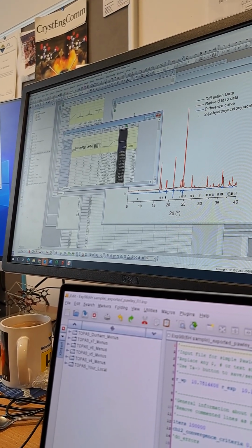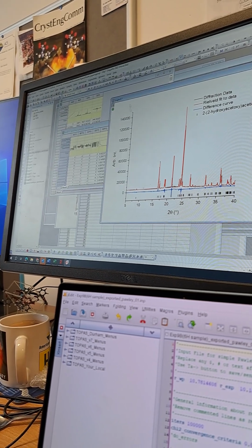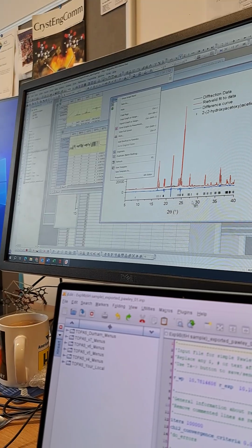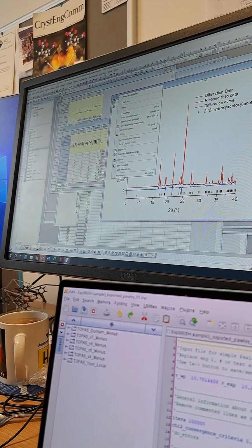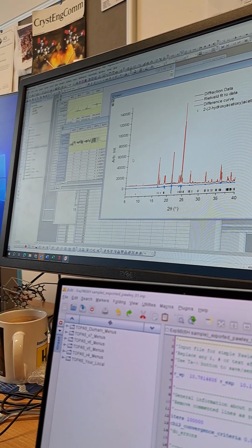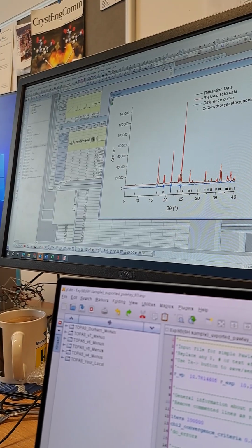And its individual is down at the bottom. But you can see here that you can save this as a template, and every time you do it, you can just use that template all the time. So you don't need to do all this X and Y and stuff associated with it. But that is a far better image than you're getting out of Topaz.